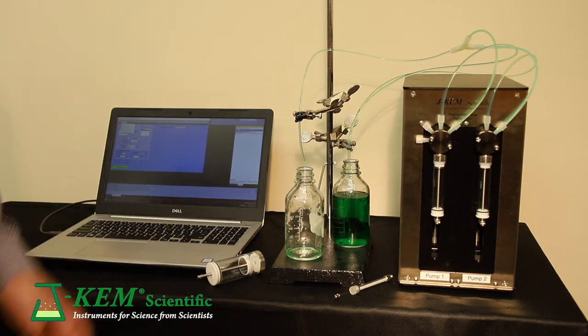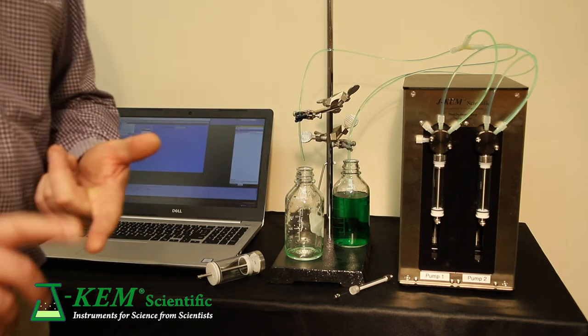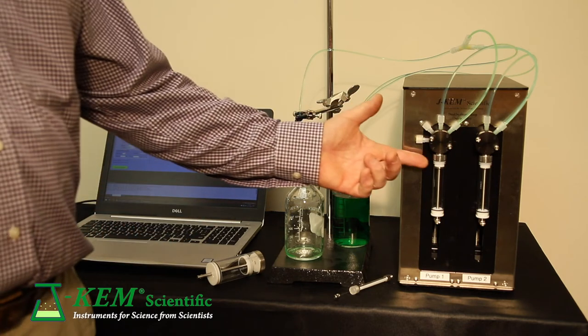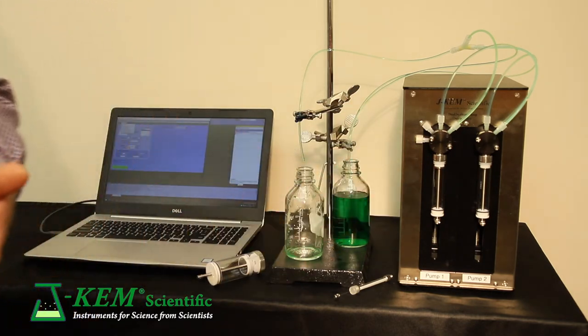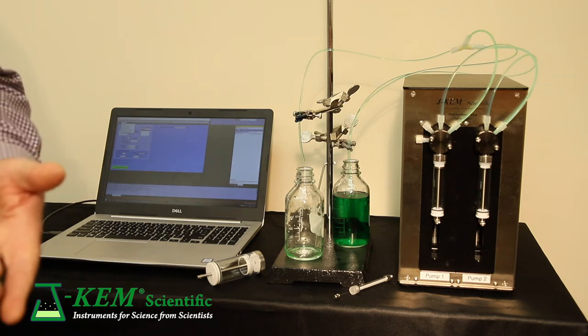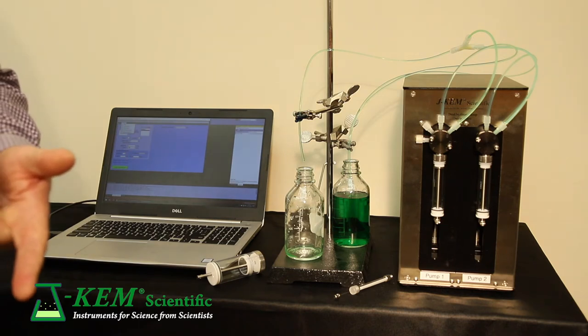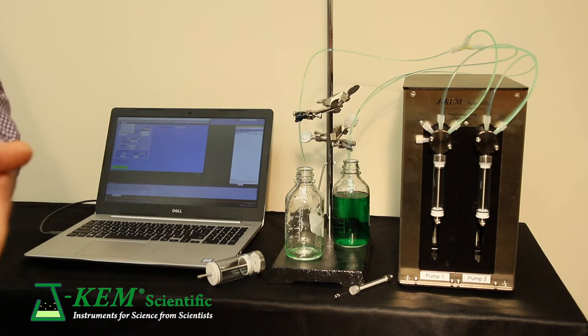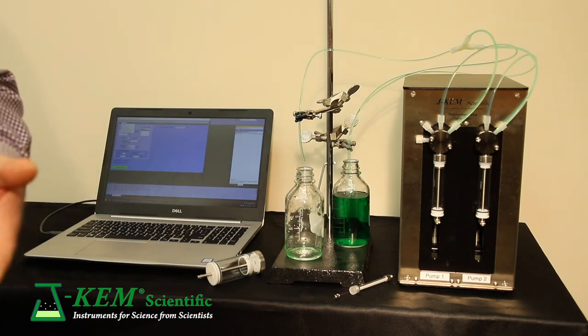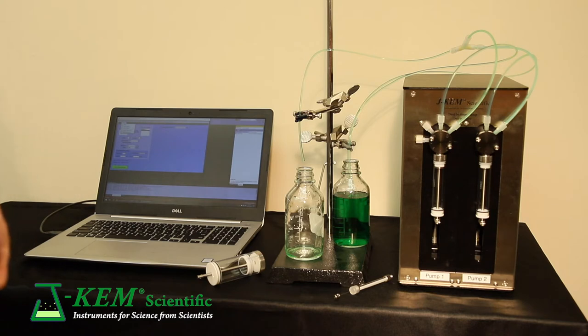What's unique about the pump itself is its high resolution. So from the top of this syringe to the bottom of that syringe, there are over 3 million steps, which give it extraordinary precision. All of our syringes with any size have microliter accuracies in their dispenses and their withdrawals.